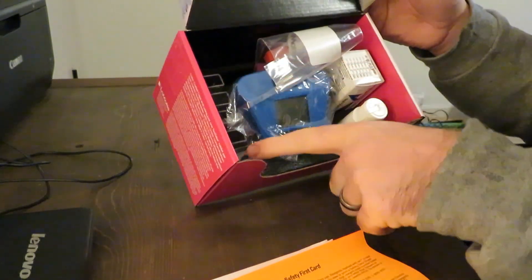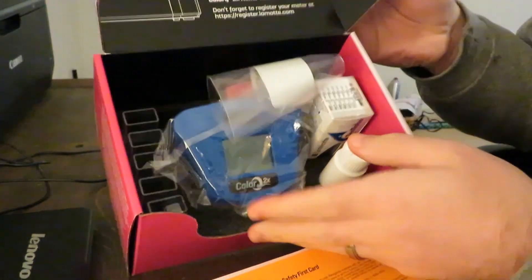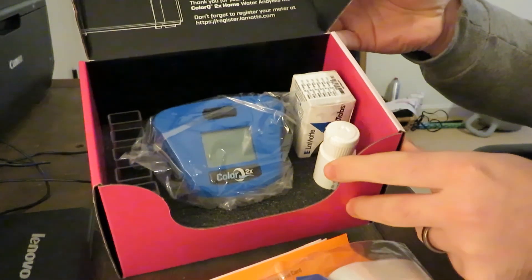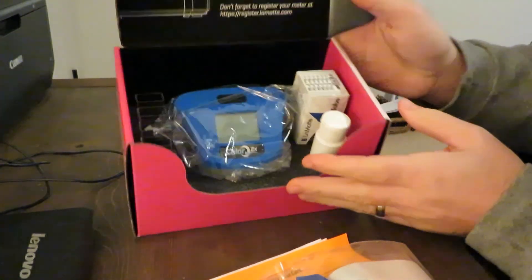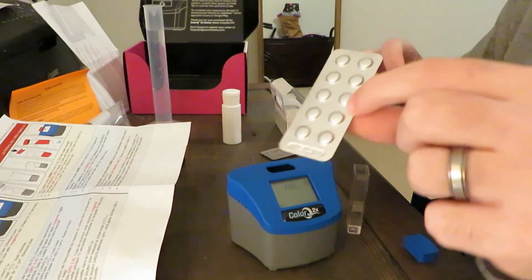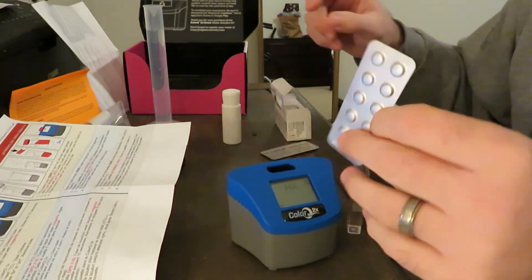You've got all your tubes over here, nice and neat with all your caps in different colors, organized. It comes with a cleaning brush inside to clean out the tubes. Within the kit come your reagents — they come in little packs like this, and there are 20 of them within this kit.